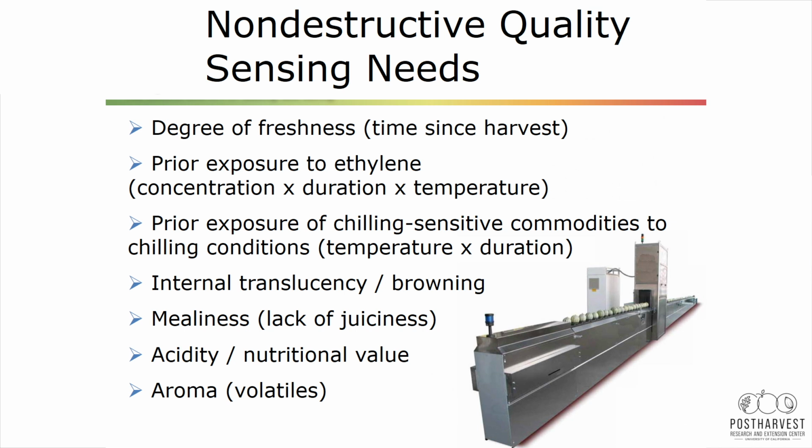Okay, so it goes without saying that a lot of these methods that I showed you are destructive methods for measuring these things, right? Even something as simple as a refractometer reading, you have to juice your fruit. So you have to basically sacrifice some fruit, something that you don't want to do. So we really dearly need more ways to non-destructively measure flavor-related components and other things, right?